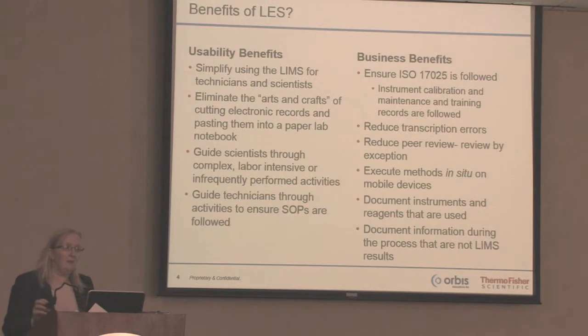And again, the user has to have a training record, or they have access within SampleManager based on their roles, so that for a particular step, they can only execute that step if they have the correct access level and correct training.